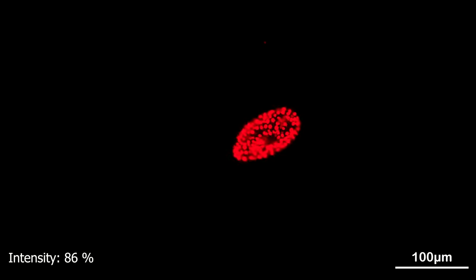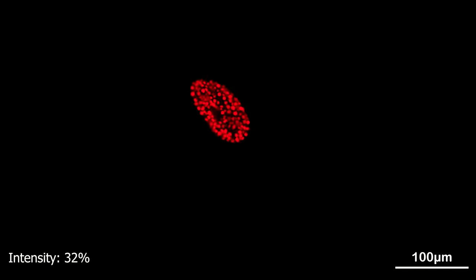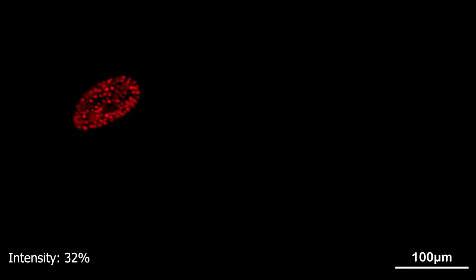In this clip, we see how quickly the intensity of the fluorescence signal declines when paramecia are excited. This is an indicator of non-photochemical quenching taking place.